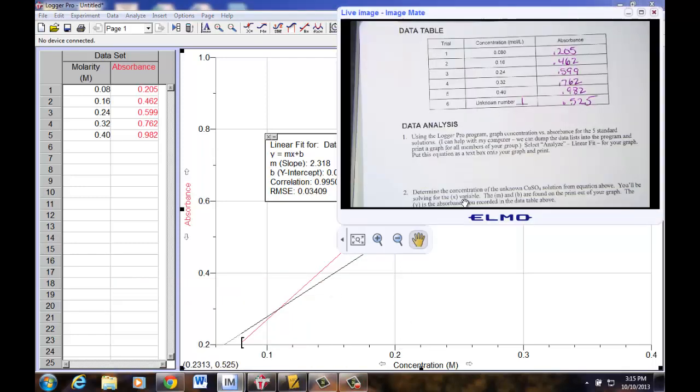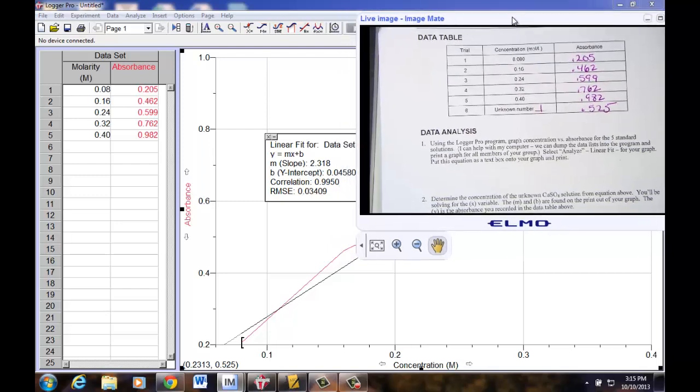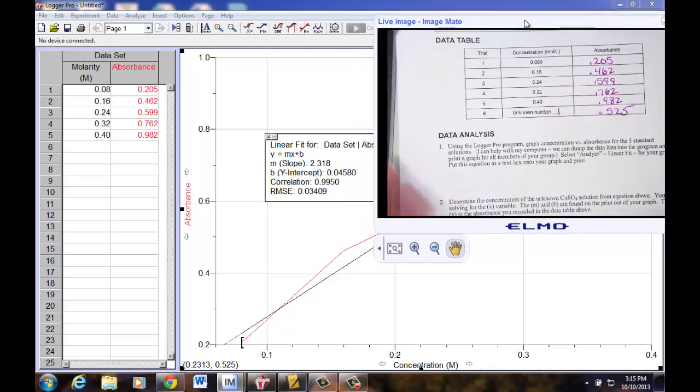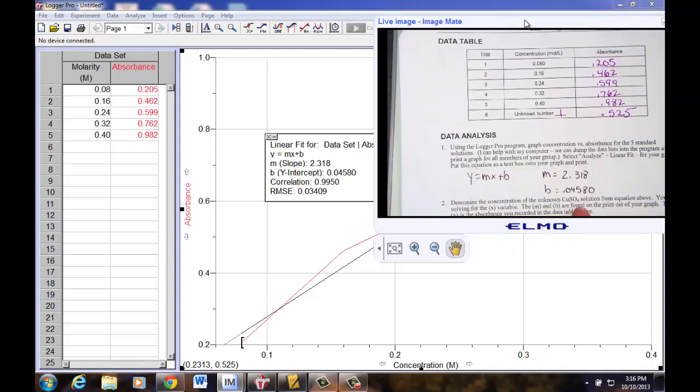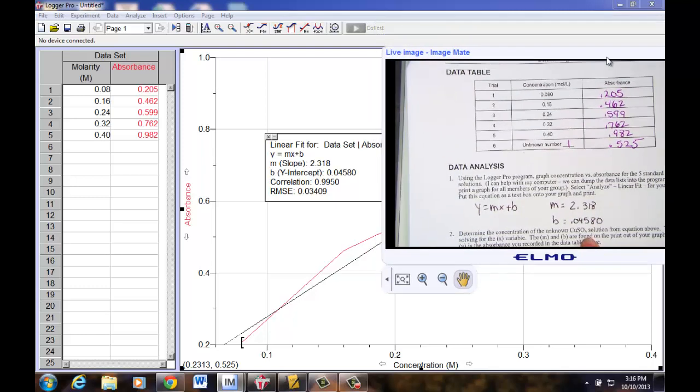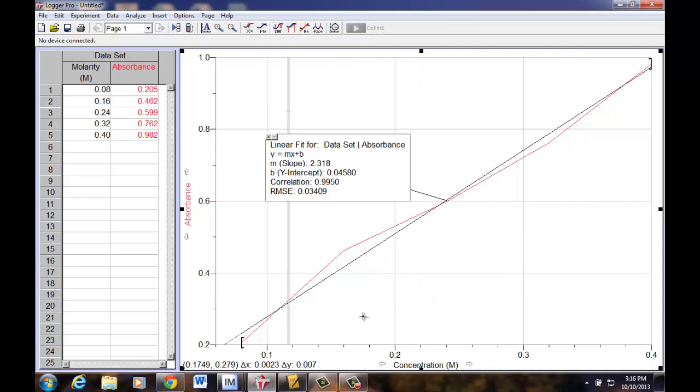So what we'll need to do is record on our page under Data Analysis 1 the values for the Y equals MX plus B slope. So let's suppose, can I fit these both on? I want to simply record for Y equals MX plus B my M value, which is the slope of the line, 2.318, and the Y intercept value of 0.04580. I'll just record that right here on my data table.